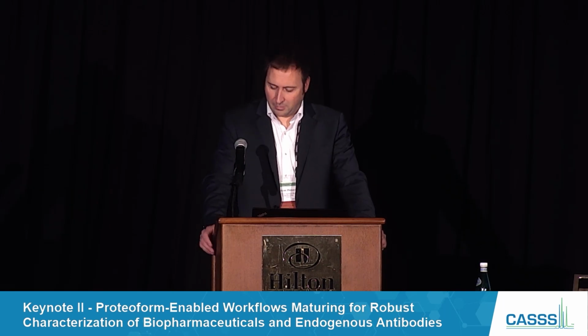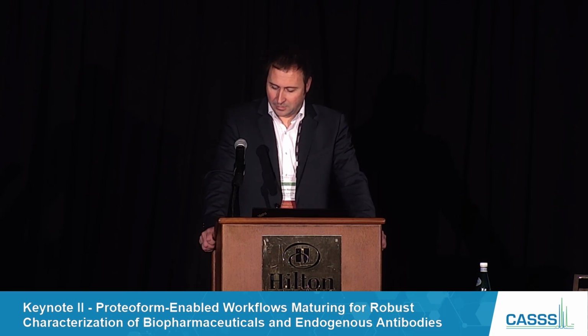At that time, and also during my diploma thesis, I was to characterize glycolipids, LPS, things like that. I was not into proteomics. But we had a high-res mass spectrometer, and it was due to a research proposal. After an upgrade, we even had electron capture dissociation, which brings me closer to Professor Kelleher. And we thought the next idea was to use capillary electrophoresis to separate our analytes prior to mass spec analysis. If you took all this mixture and started searching for literature back then, you inevitably kept coming across his name.